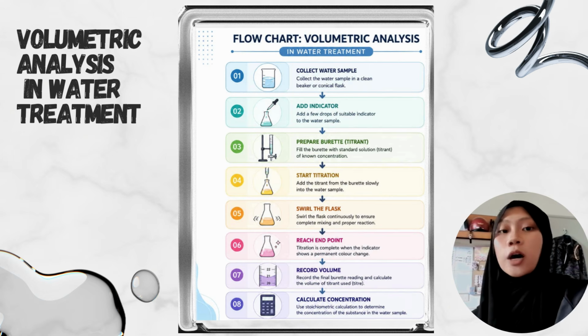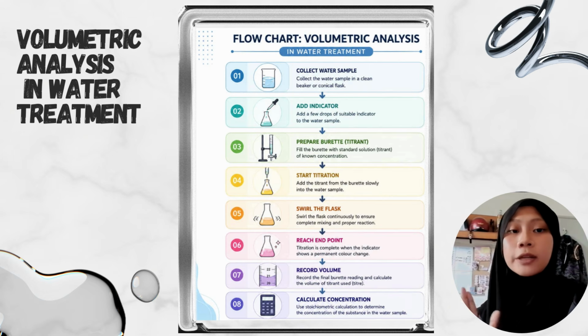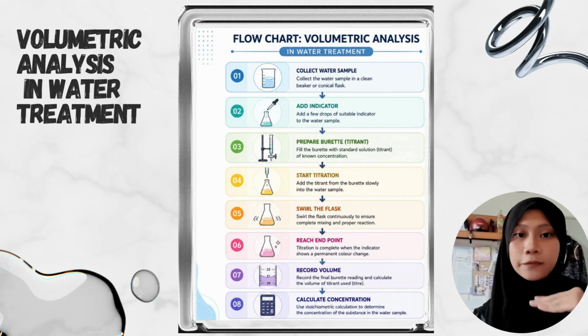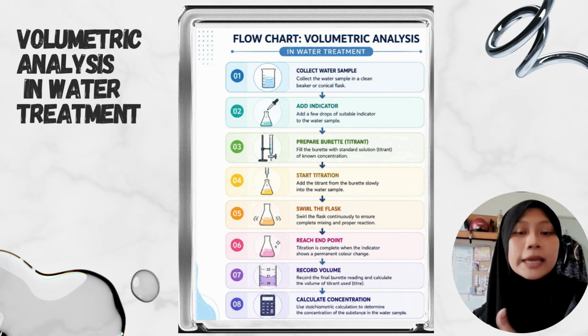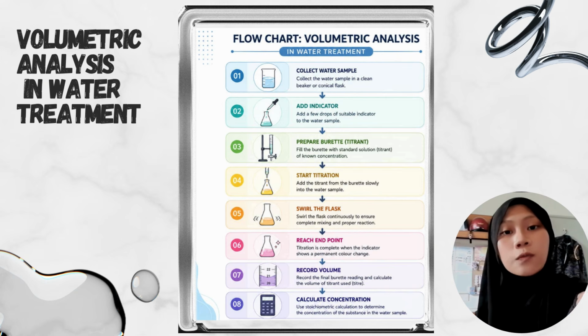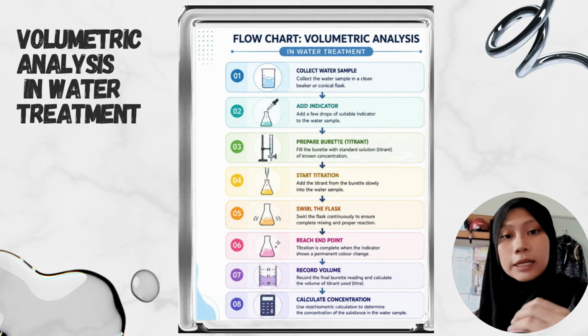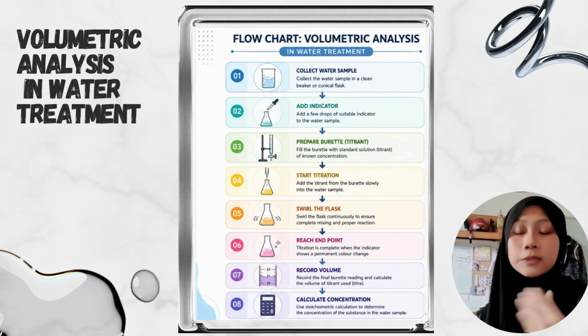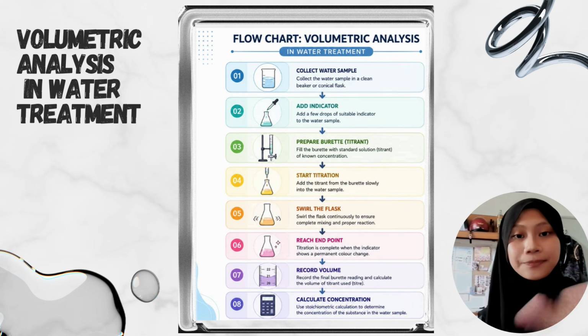Seventh, we need to record the volume. Record the final burette reading and calculate the volume of titrant used. We should read the volume at the meniscus at eye level and avoid parallax error because it can affect your data. And lastly, we need to calculate the concentration. We calculate the concentration based on the data we recorded to determine the concentration of the substance in the water sample.